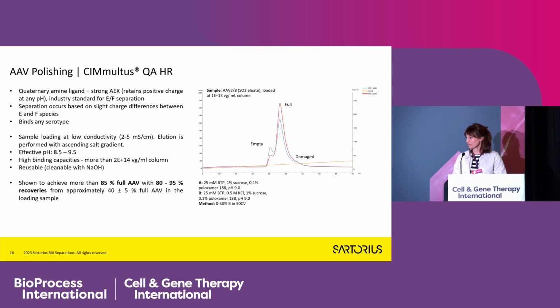Working on the QA column, we many times see this third peak. I'm not sure if you've seen that as well. And it's more electronegative, definitely. We don't know yet what is really causing this, but in some cases, with different capturing strategies, this peak is higher or lower.